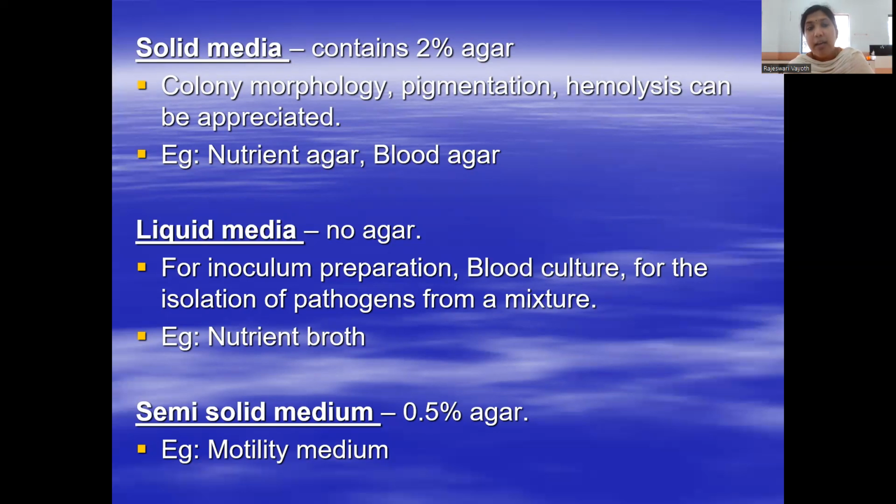Liquid media does not contain agar. Agar is the solidifying agent. Liquid media is used for inoculum preparation, blood culture, and also for the isolation of pathogen from the mixture. Example for liquid media is nutrient broth. Broth means liquid media.